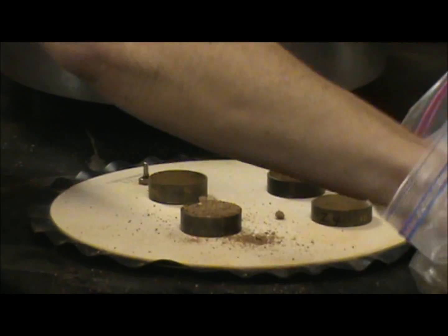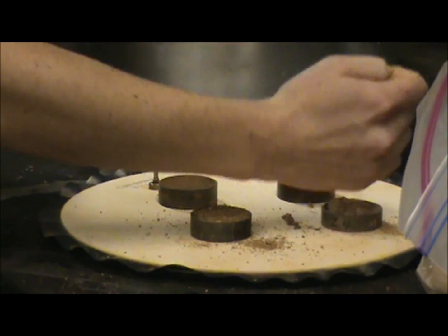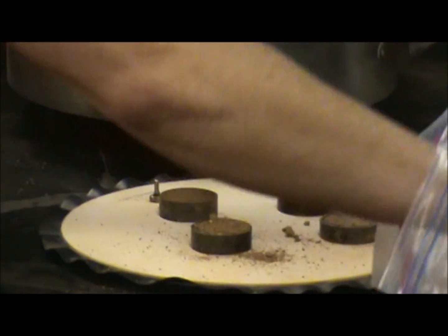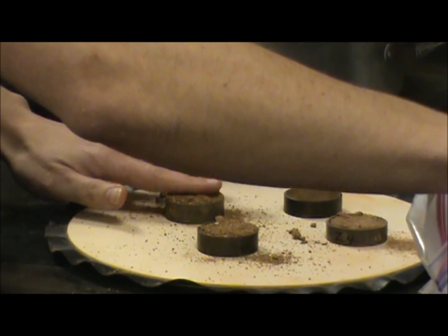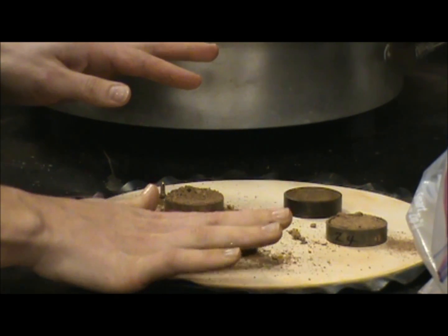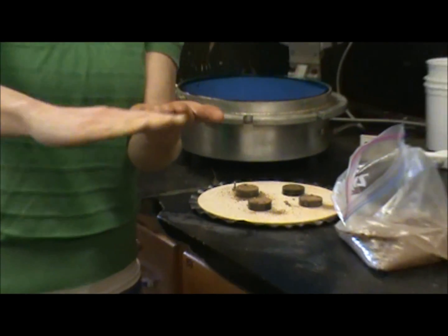Right, just like that. You don't want to pack it down or anything; you want it to be in its natural state. You want to make sure that, just like with the larger soil cores, that it's even across the top.